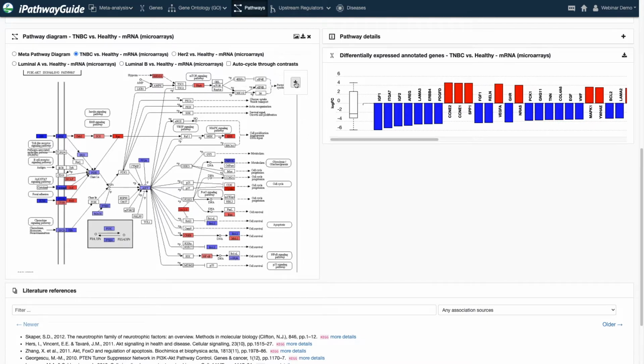And we can look for coherent cascades. So this is just fold change, and we're just looking at where do we have agreement between what's on the pathway and what's given in our data. So where do we have interactions between genes that match the fold change patterns that were measured in this experiment.